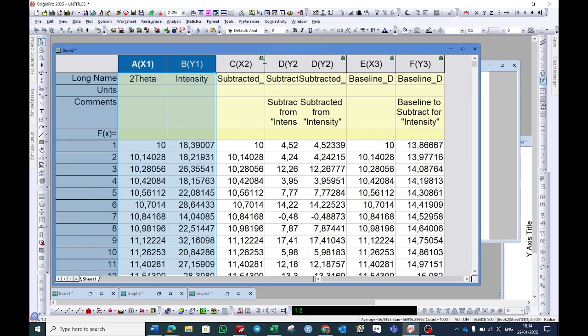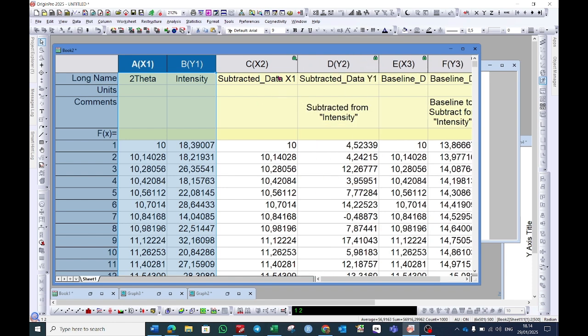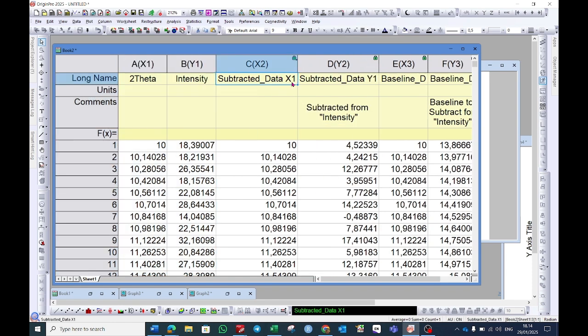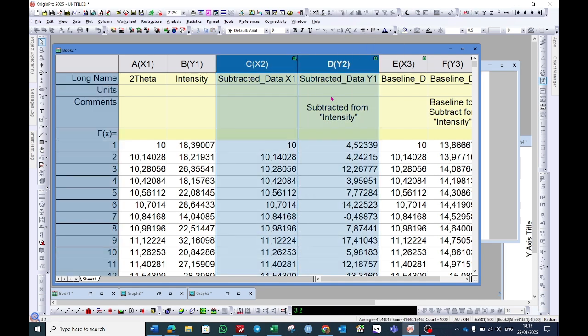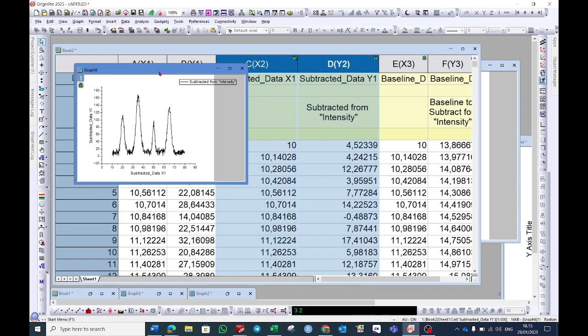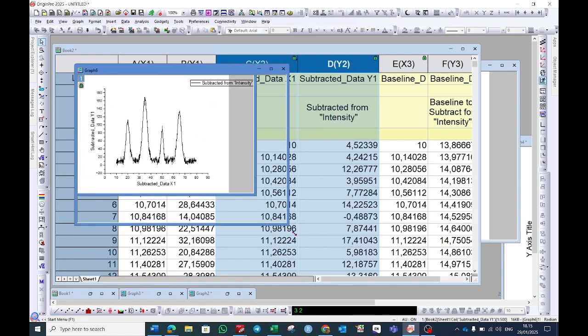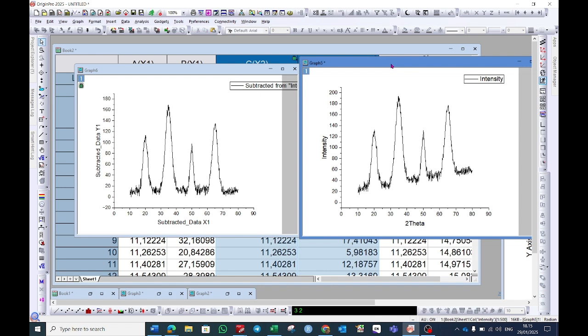In the first two columns, I will open it. The first one is subtracted data X1 which is 2 theta value, and subtracted data Y1 is the intensity value. And these are the baseline correction values that has been generated. Select subtracted data X1 and subtracted data Y1, and now choose this line graph again. So here you can see that the baseline correction is performed.